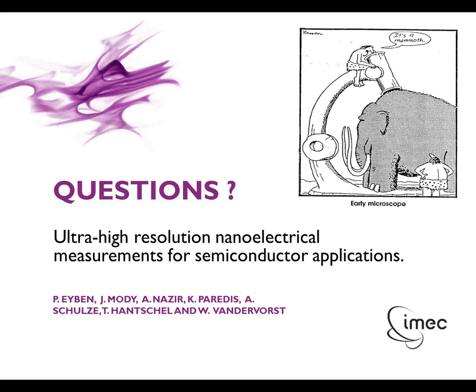Thank you. Let me maybe do one more. I think we're running way over time, so we may stop soon with the questions, but follow up later. Here's one on resolution. I think this follows up on the earlier resolution tip versus technique question, referring specifically to where you mentioned that 0.3 to 0.5 nanometer resolution is attainable. Can you comment on that more? Is this tip limited, or could the technique even be pushed further than this?